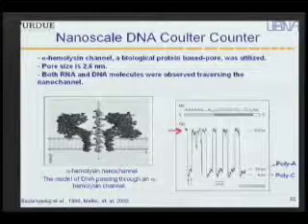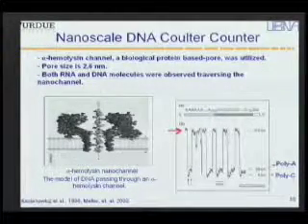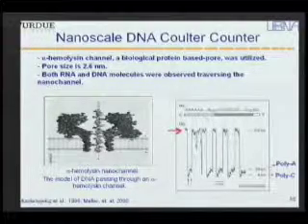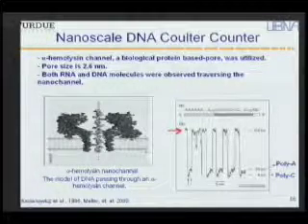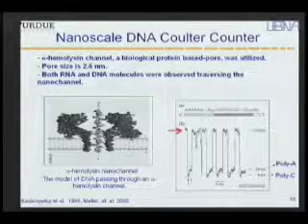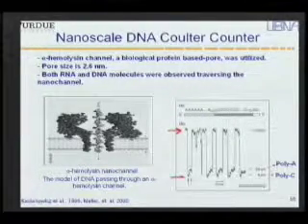Okay. Now, what was also very interesting was this is really a size effect, right? Because you're really blocking the pore by the bases of the DNA, or by the DNA and its structure. So what was also very interesting and promising here, they actually saw differences when you pass a region of molecule that has only C's versus only A's.